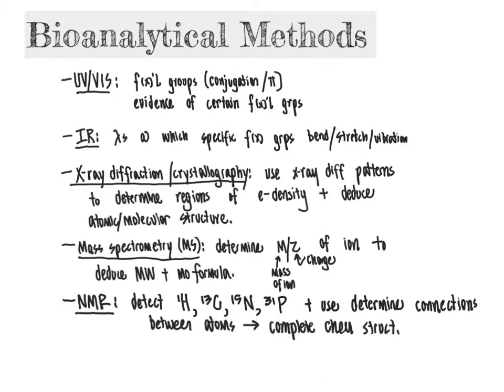We are going to be spending most of this unit on NMR, looking at both the traditional one-dimensional NMR experiments that we covered in the organic chemistry course, that being proton NMR spectroscopy, and also carbon NMR spectroscopy. But we're also going to get into the more powerful two-dimensional NMR experiments that allow us to directly relate which carbon and hydrogen atoms are directly bonded to one another, and also which hydrogen atoms are in the same spatial proximity as other hydrogen atoms, and things like that to come up with a complete understanding of the full structure of a molecule.